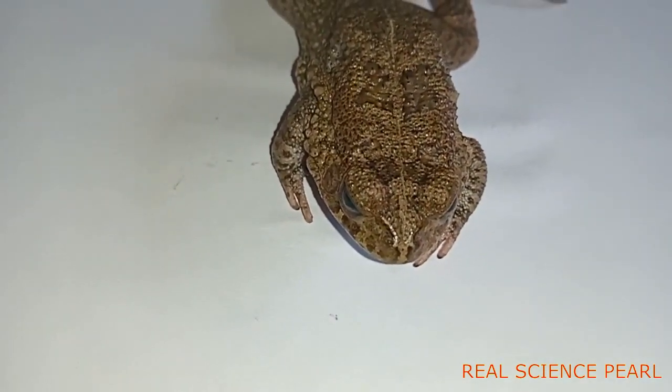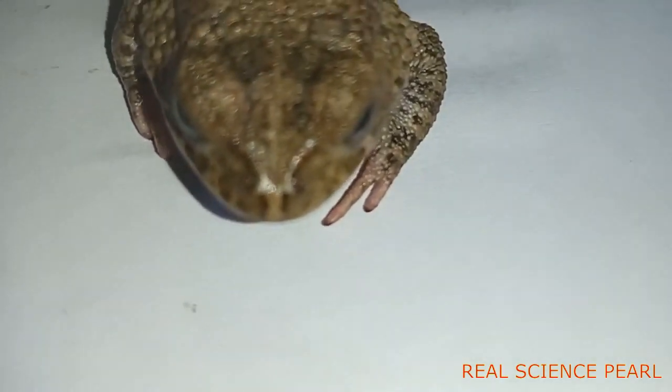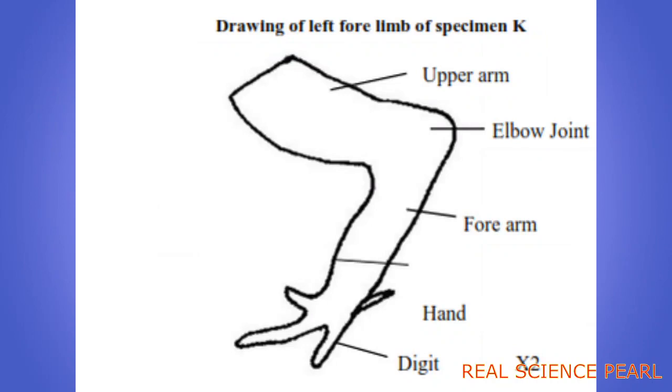You may be required to draw the fore limb. Your drawing should have a title, labeling if required, and the magnification. You are supposed to make your label lines horizontal.